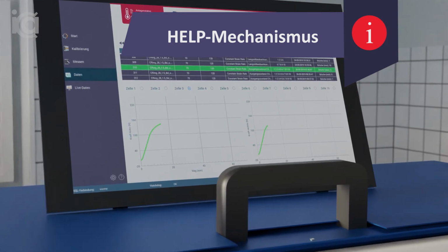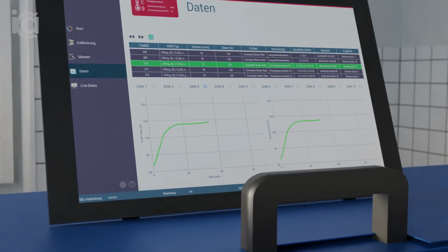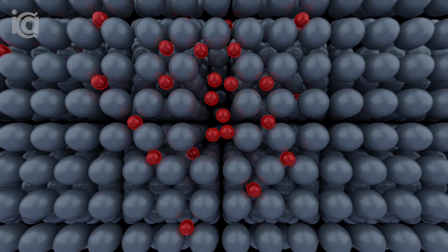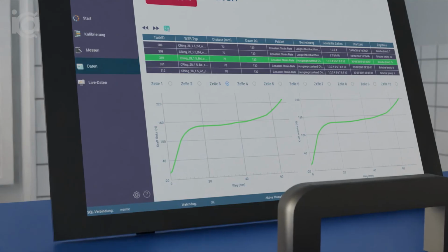Measuring the tension energy yields valuable information on the tension behavior of different materials. If atomic hydrogen dissolved in the crystal structure leads to hydrogen embrittlement, then a significant reduction in the energy needed to bend the specimen is observed. This is accompanied by a detectable brittle fracture.